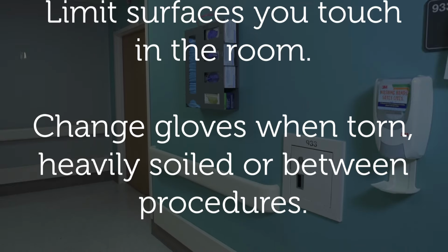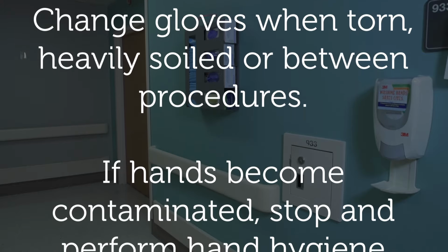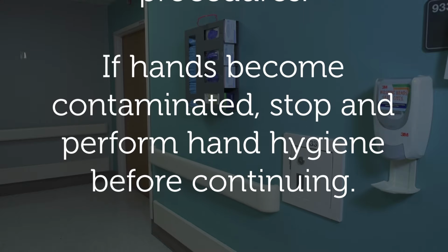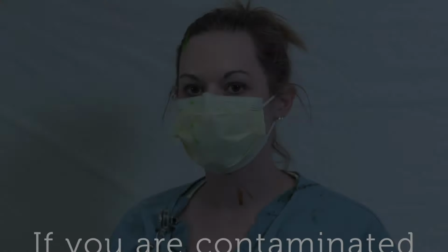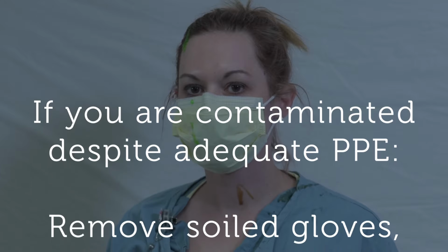Change gloves when torn, heavily soiled, or between procedures. If hands become contaminated during PPE removal, stop and perform hand hygiene, then proceed with PPE removal. If you are contaminated despite adequate PPE, complete the following steps.